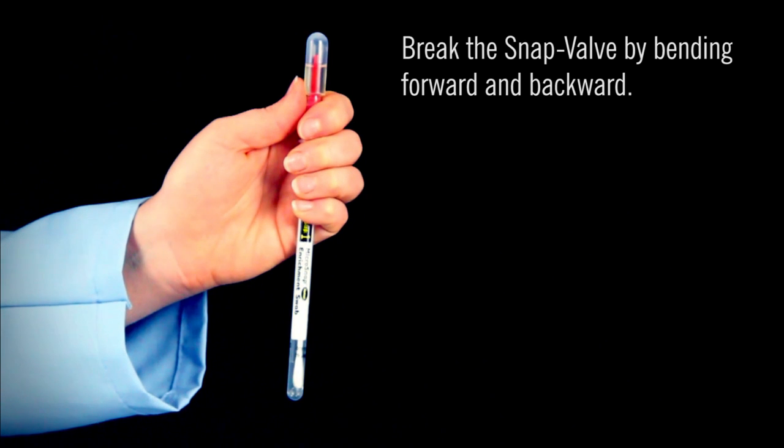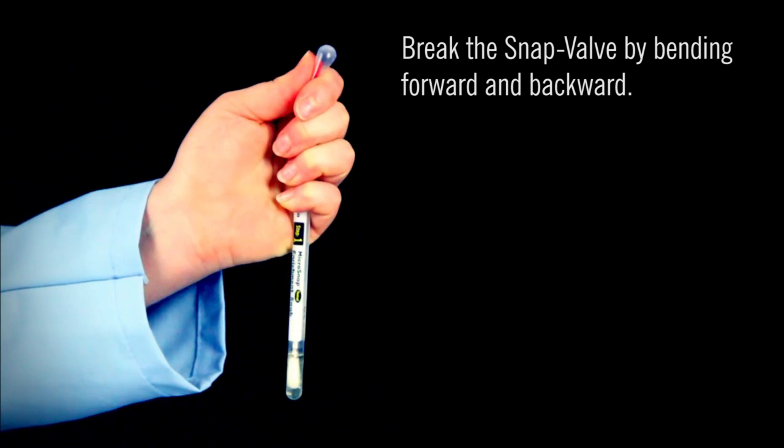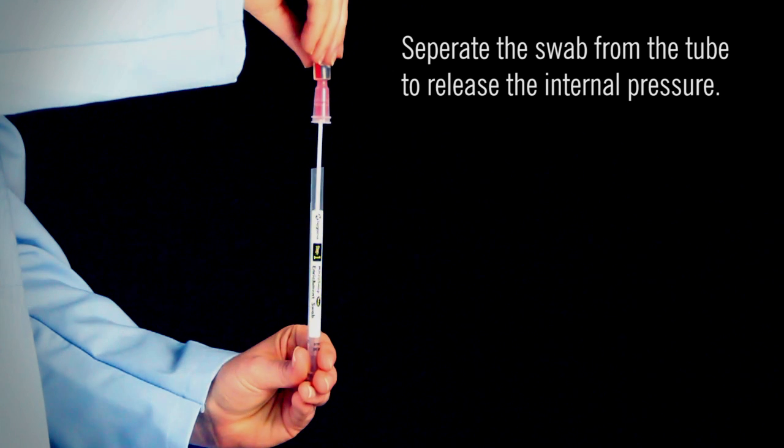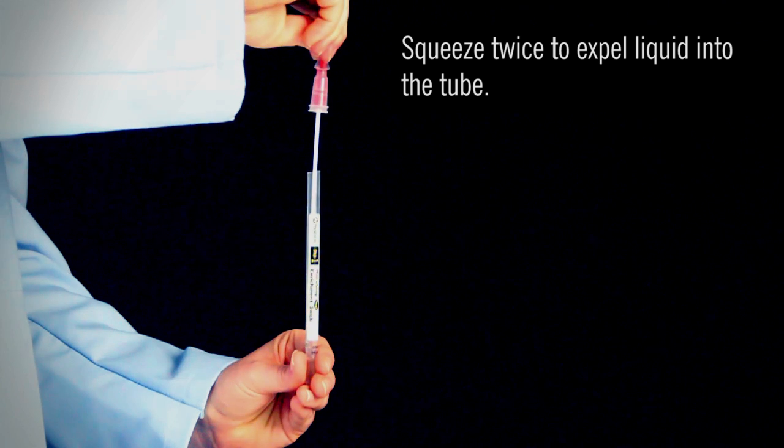Hold the device in your fist and use the thumb and forefinger to break the snap valve by bending the bulb forward and backward. Separate the swab from the tube to release the internal pressure and squeeze the bulb twice to expel liquid into the tube.